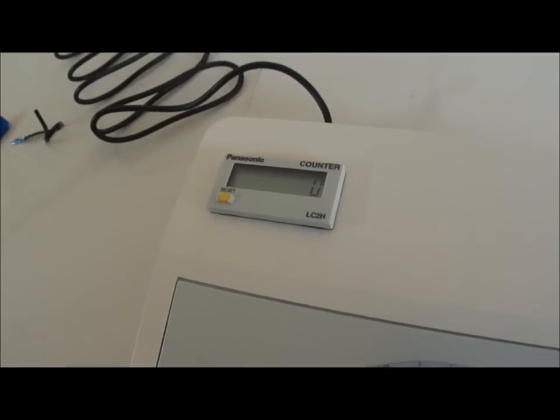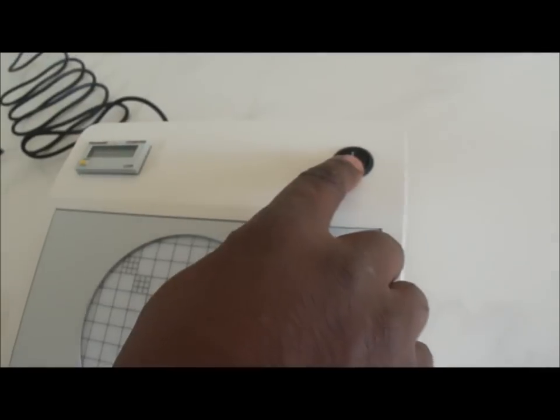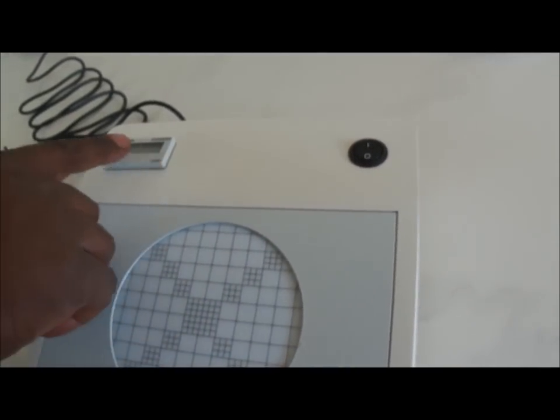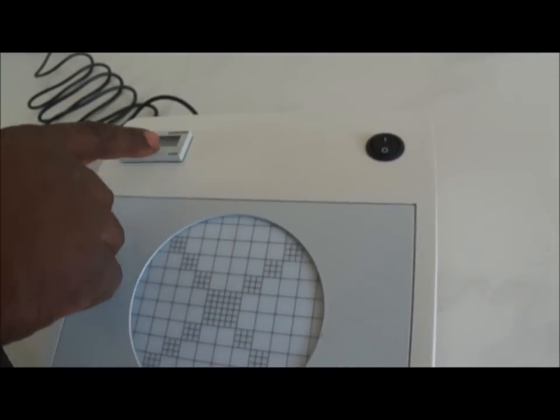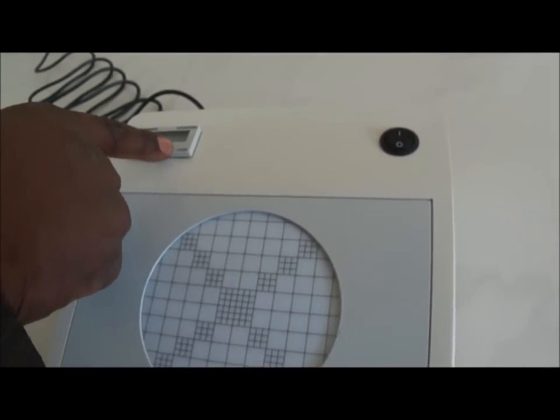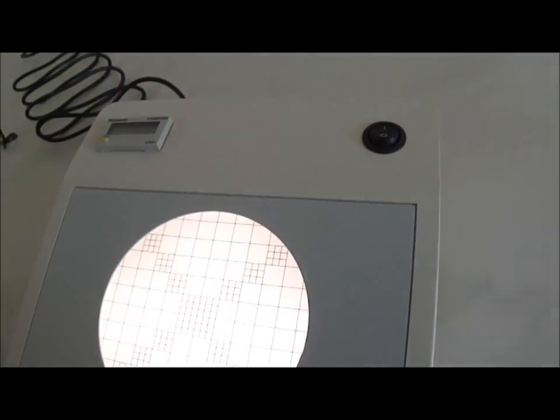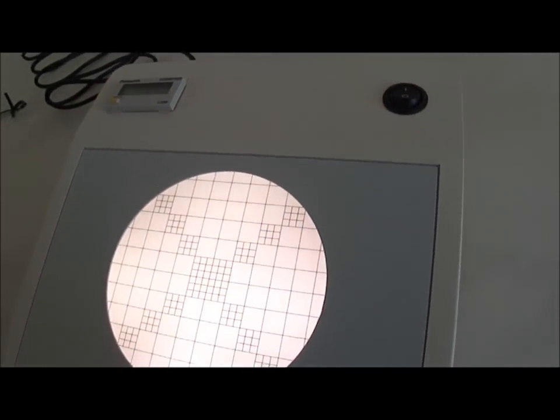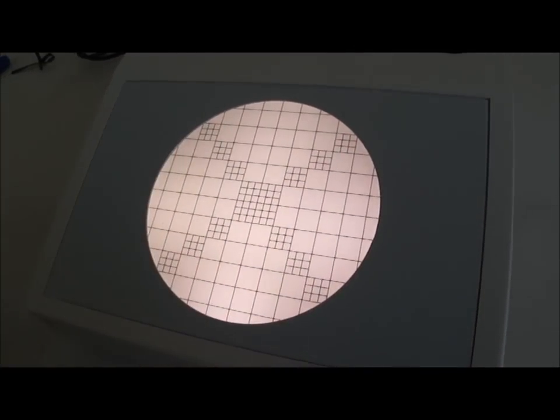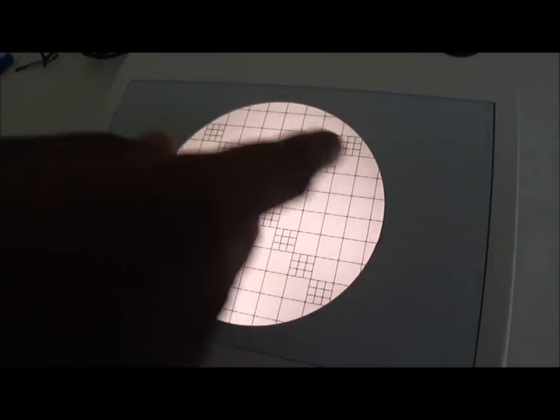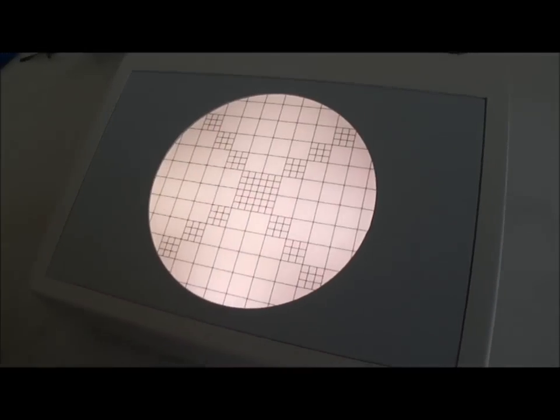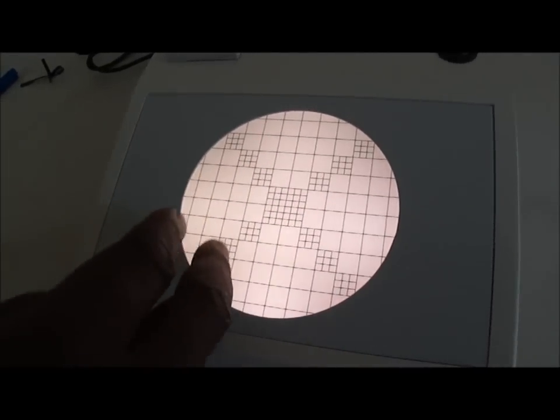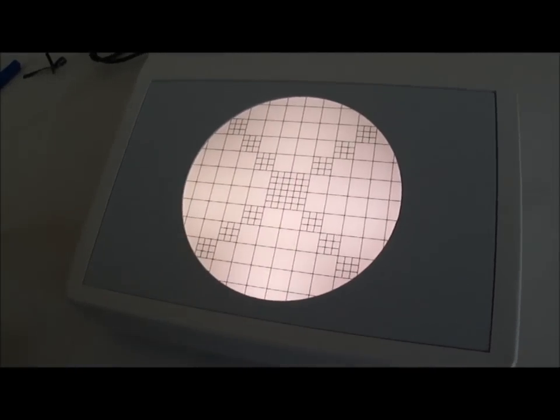And you have the main switch here, you see here it's working because the battery is providing some energy, but normally I put it here on with the main switch, and you can see the main, the central part, that's called the plate.